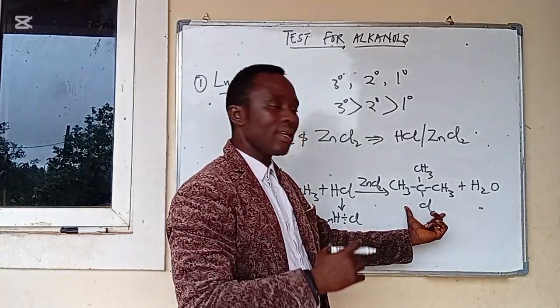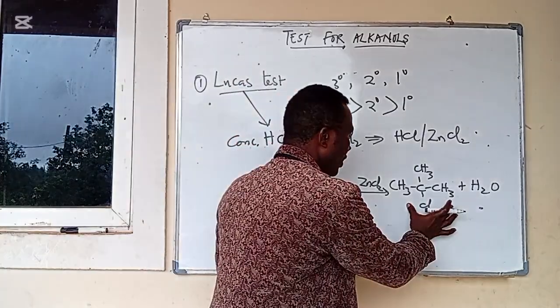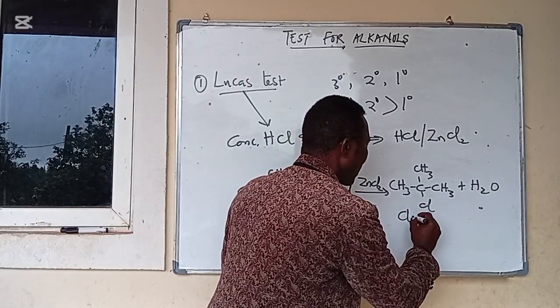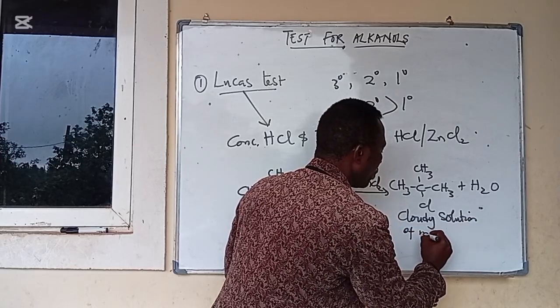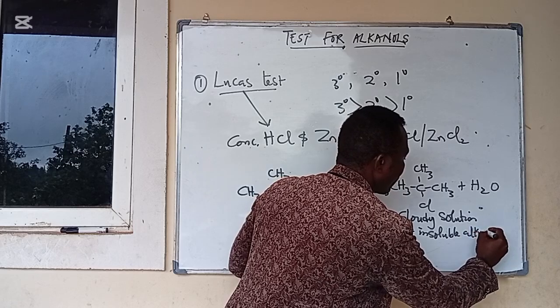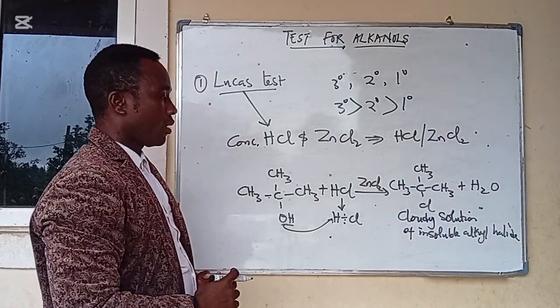This alkyl halide is insoluble. So the solution that will be formed here is a cloudy solution of insoluble alkyl halide.